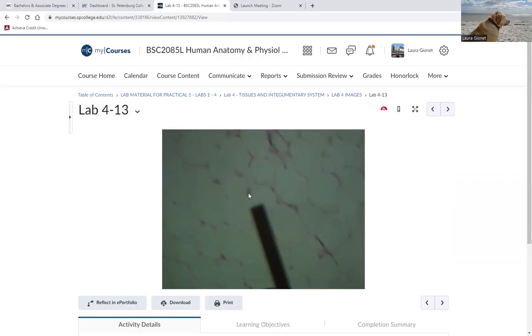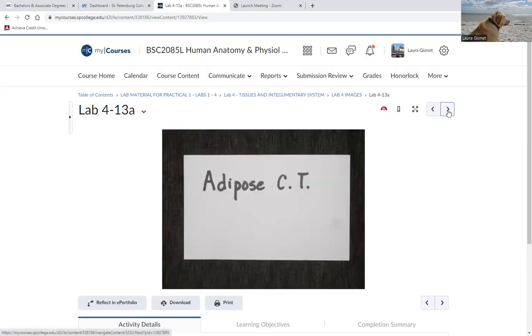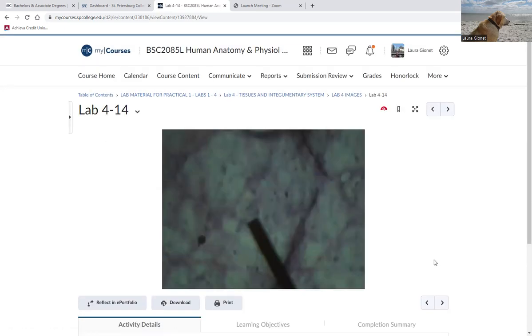Right? And then sometimes you can see the nucleus pushed off to the side. What's taking up stain here is the plasma membrane. The fat won't take up stain. And often when the specimen is created, the cell gets cut and the fat punctures that vacuole or vesicle, and all the fat leaks out anyway. So really all you're going to be able to stain is the plasma membrane. That is adipose connective tissue. It would be found in the hypodermis or subcutaneous.